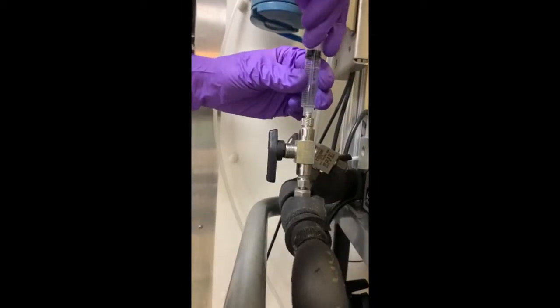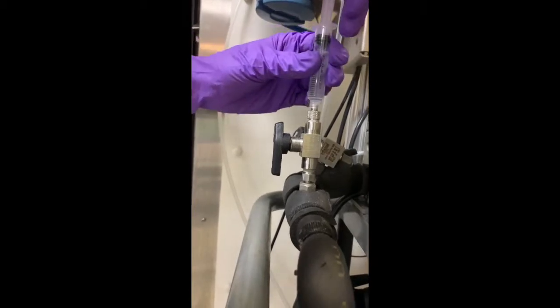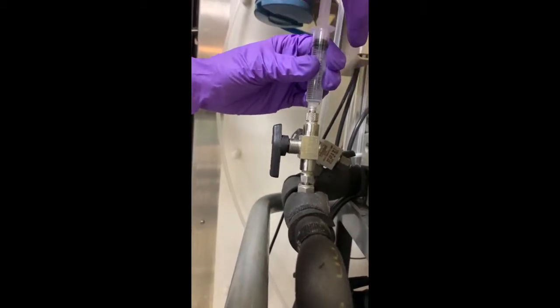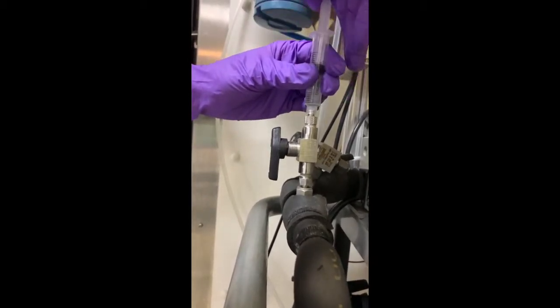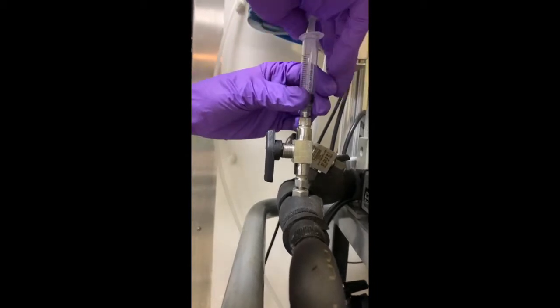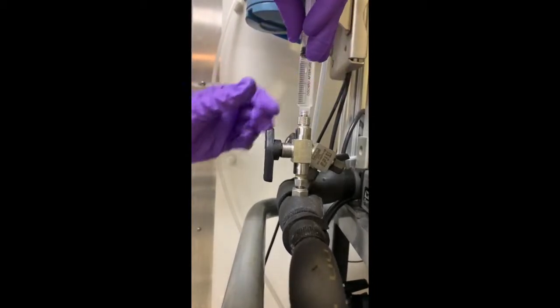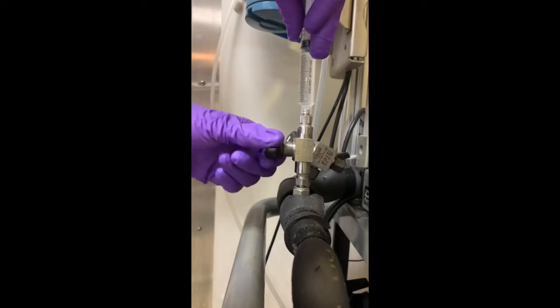A sample is taken at the beginning of the run to determine initial water loading, as well as at specific intervals throughout the run. Pressure, temperature, level, and water loading data is entered into the software to monitor the progress of the separation.